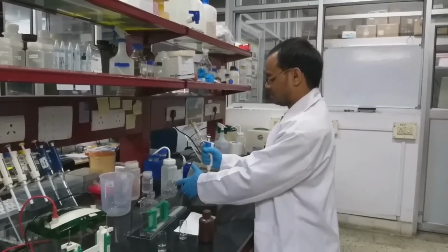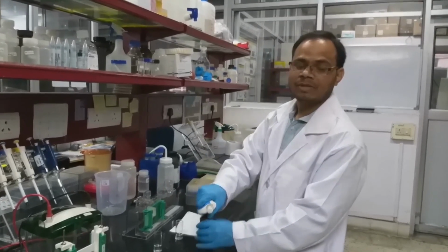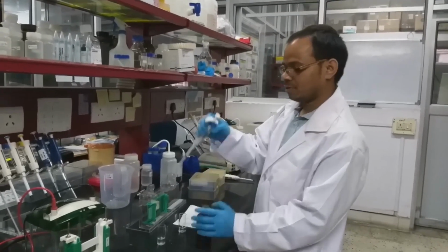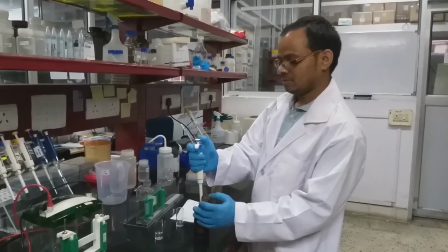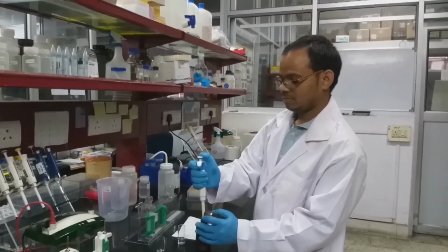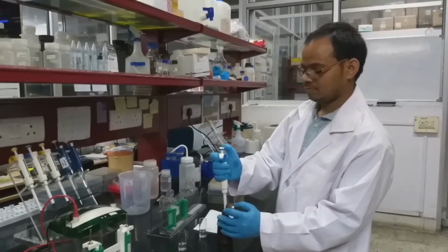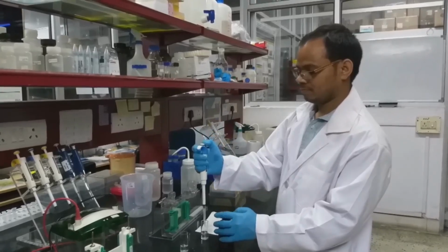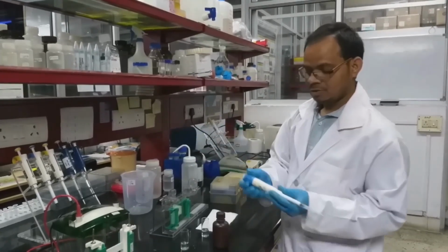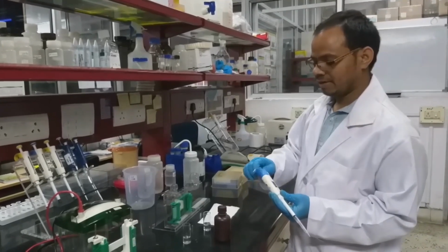So here we have to add 3.3 ml of acrylamide solution, 30%. So I have to adjust 300 microliter.